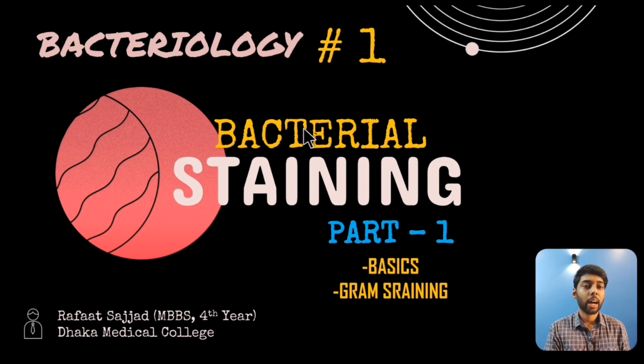So in this video, I would like to talk a little bit about bacterial staining. It's an important topic as far as microbiology is concerned. So I've decided I will discuss this topic divided into two parts. And this will be part one of the two-part series. Here, I will touch on the basics of staining, and also I will talk in detail about gram staining.